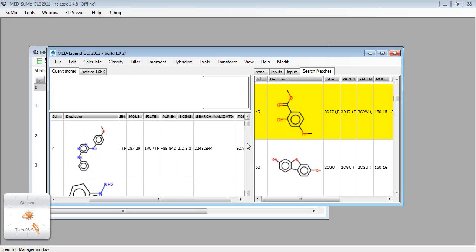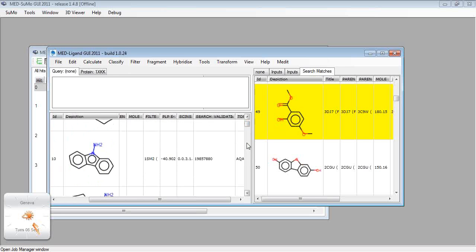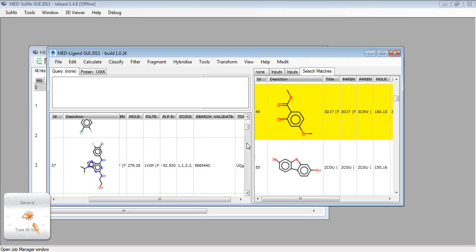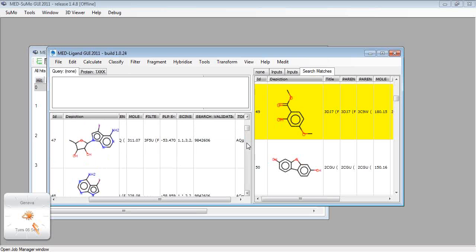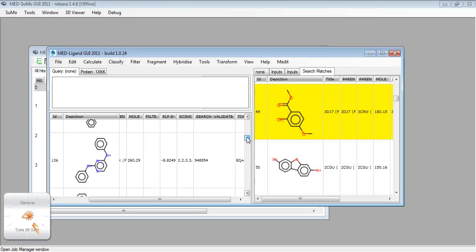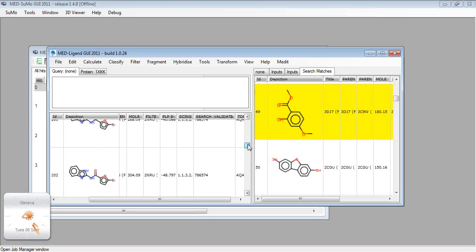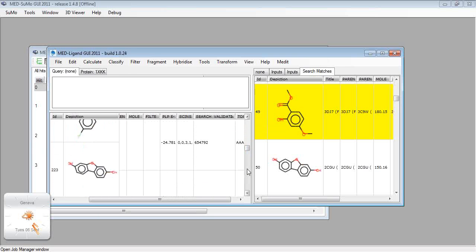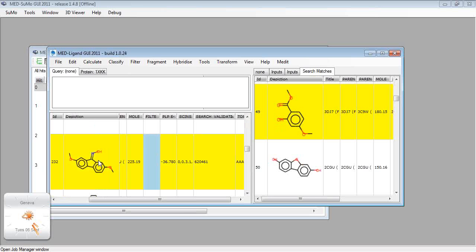I actually have a compound in mind that I could search. Well, you can actually reproduce those results and look at all those compounds by yourself. We can maybe look at this compound, which is pretty different from what is known as actives.